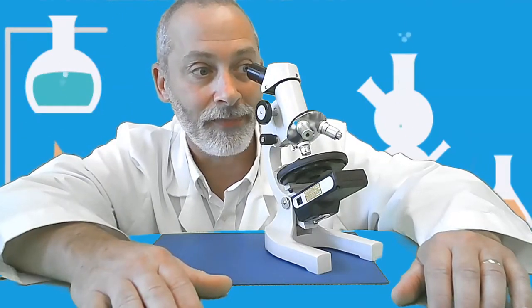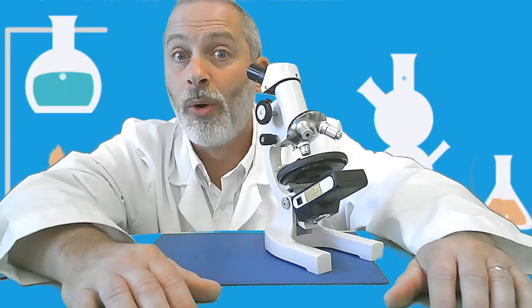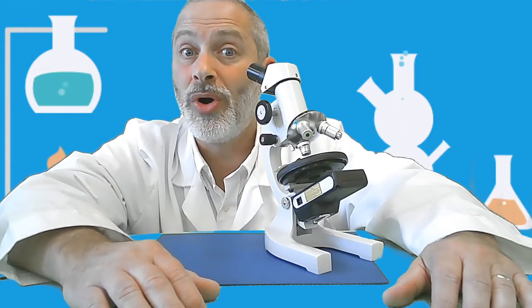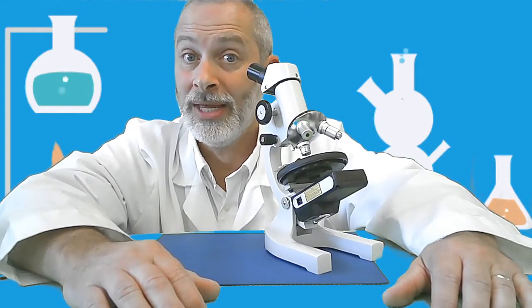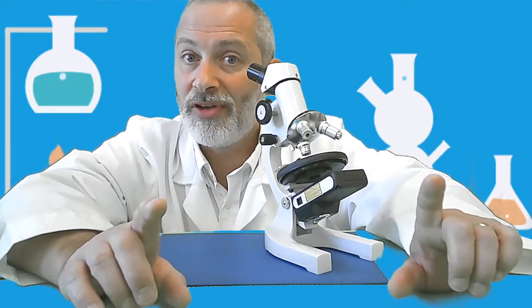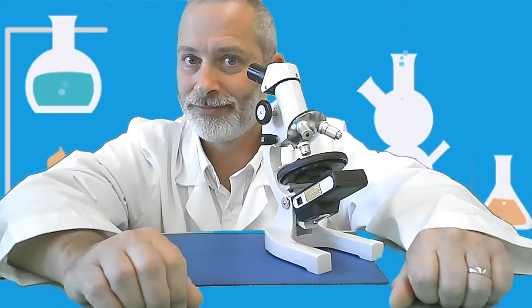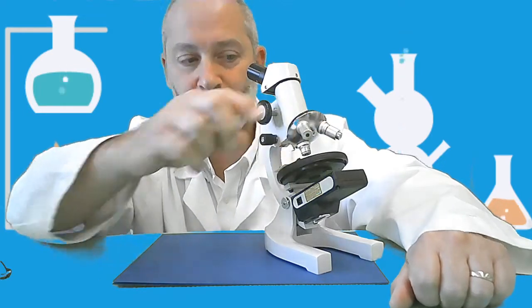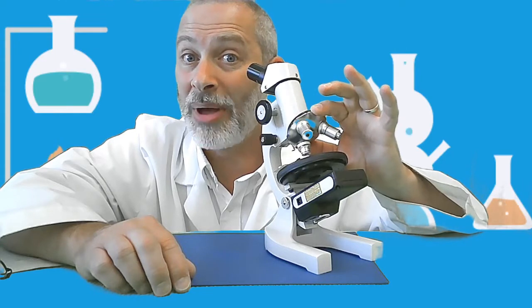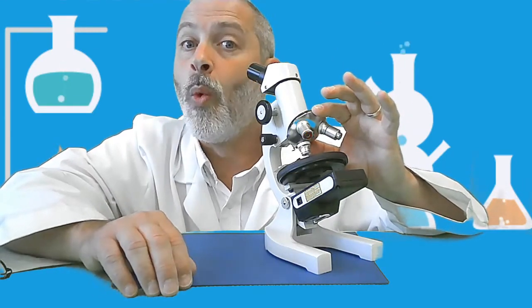Okay. Now, I'm currently looking at this specimen under low power magnification, but I know I've got to zoom in. I've got to go up to a higher power in order to see what's inside my specimen. So once you have it focused on low power, pay attention. We're going to use the nose piece. We're going to adjust the nose piece over to the medium power. When you do that, just to be safe, I'm going to watch from the side.